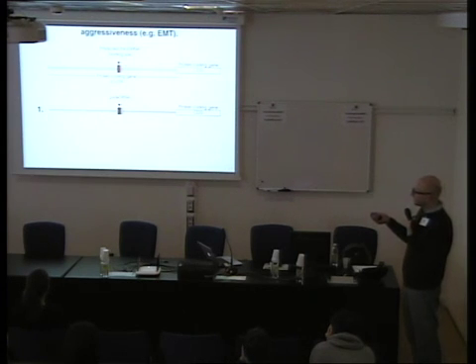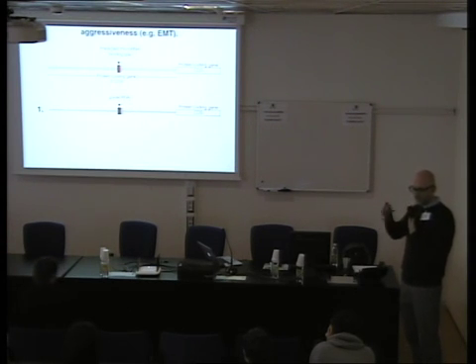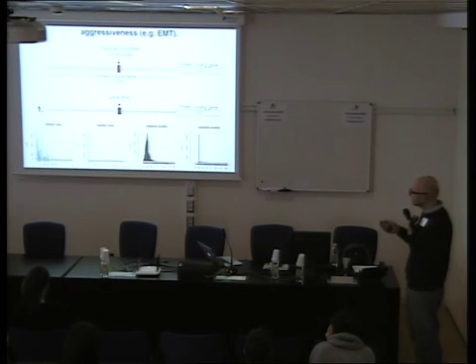In this way, you design the guide RNA that is targeting here, then you generate mistakes, errors, by non-homologous recombination and also deletions. Then you screen the clones, and you look for those that have a deletion in the 8 nucleotides of the predicted target site.